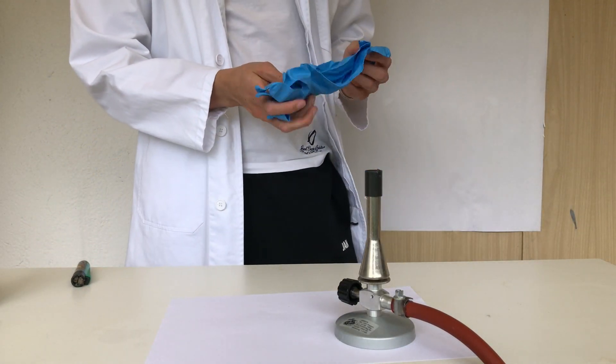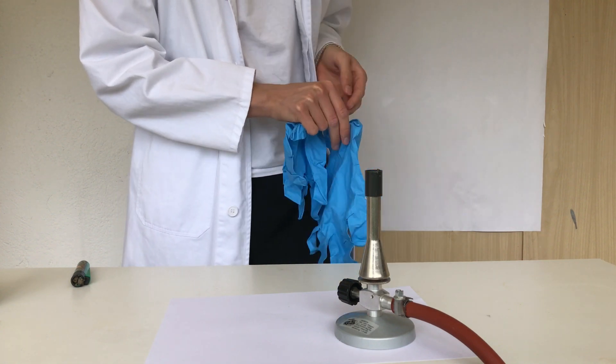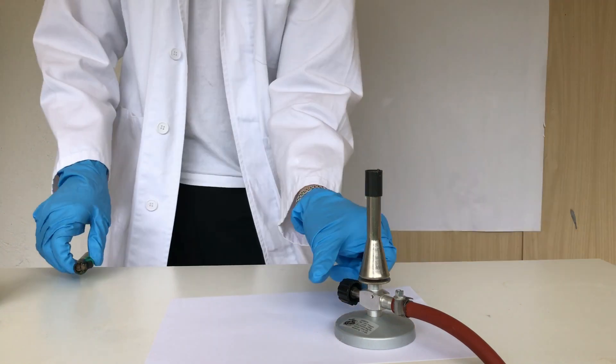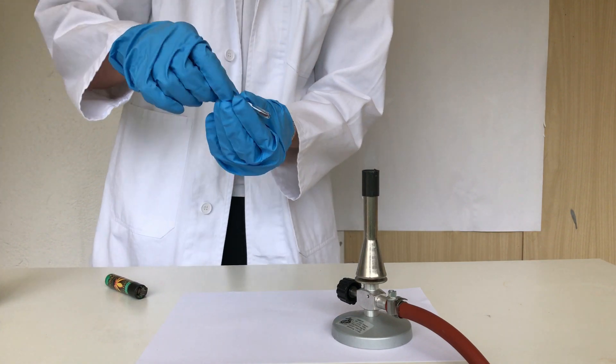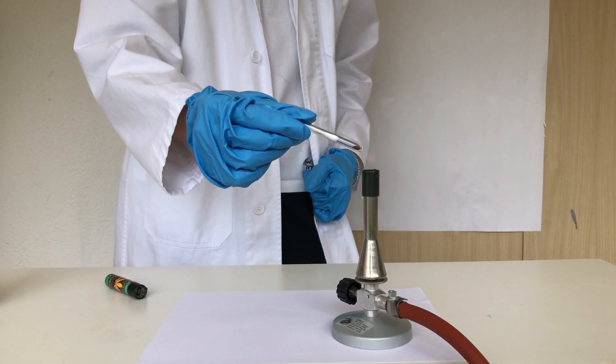Before you start, put on some gloves and maybe also work in a fume hood or wear a respirator. Light up your Bunsen burner, and after it is lit, take your test tube and hold it into the flame.